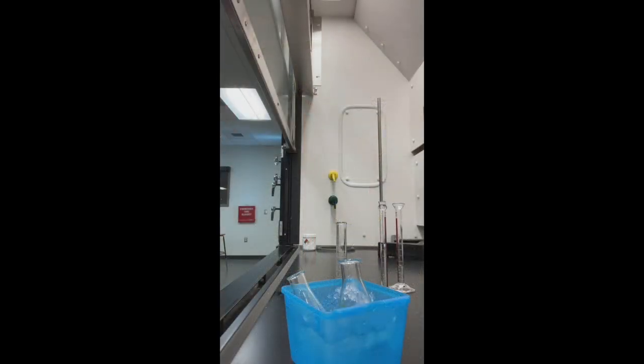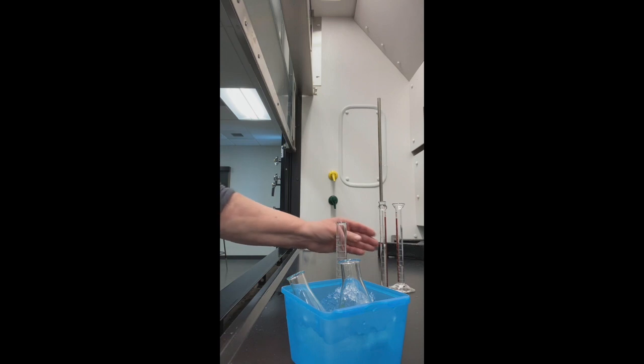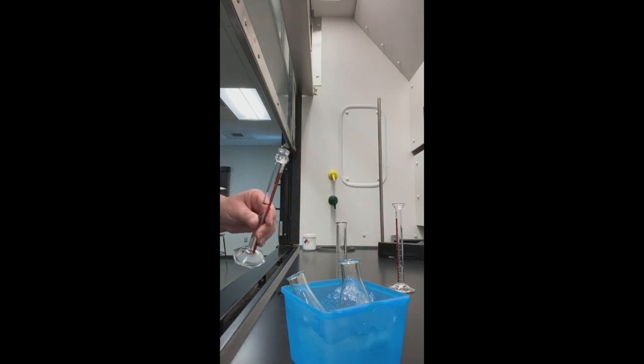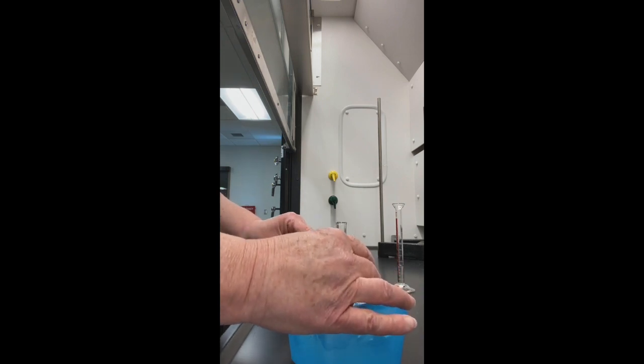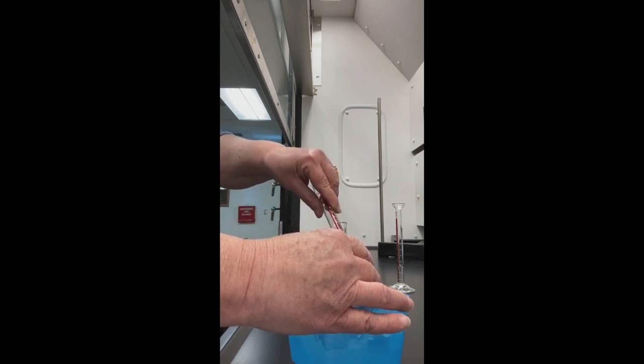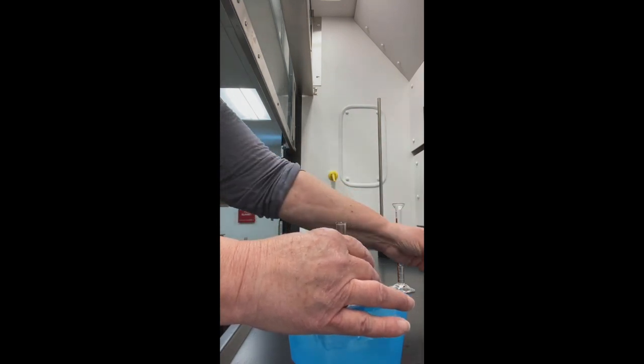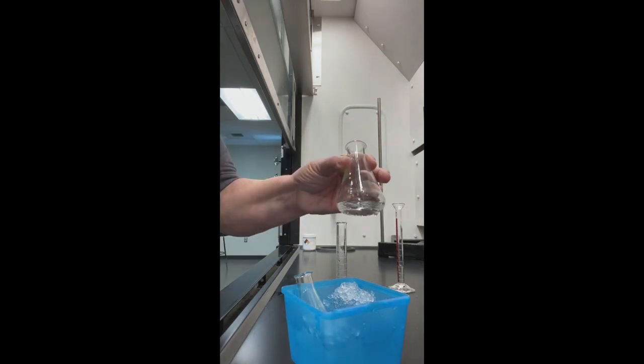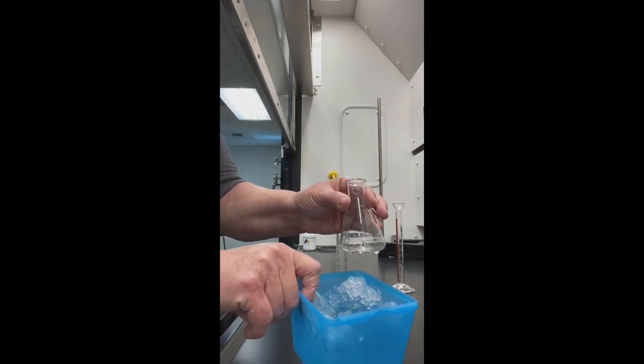Now I have measured out my acids. I'm going to add 7 mls of sulfuric acid to a 125 mL Erlenmeyer flask. Right now there's nothing else in this flask with it. It's just the sulfuric acid, and I have it in an ice bath.